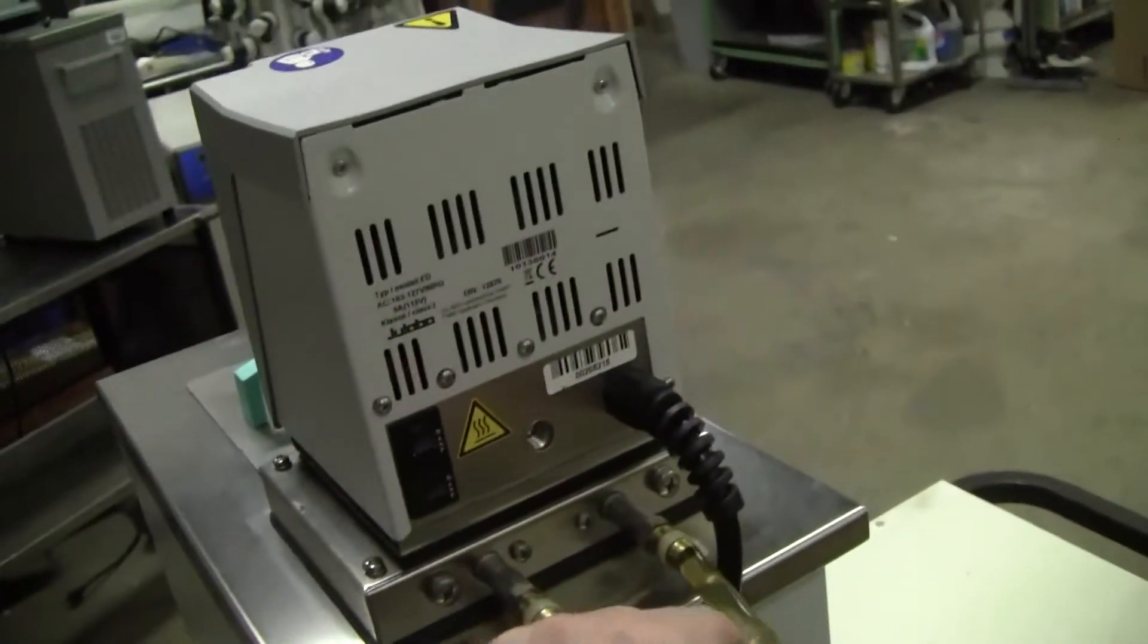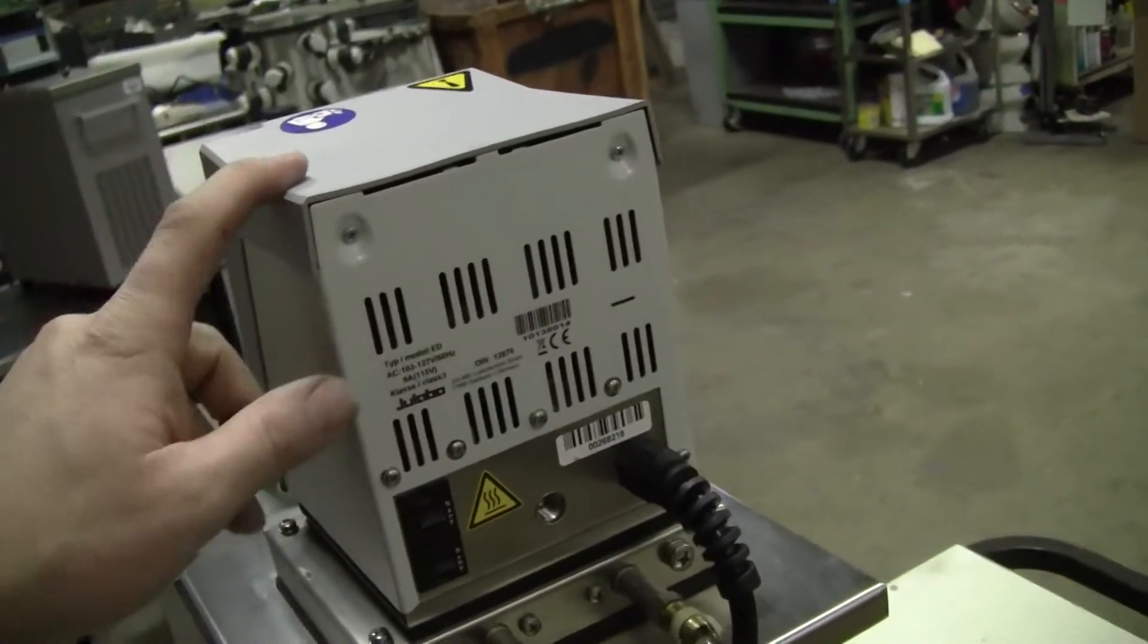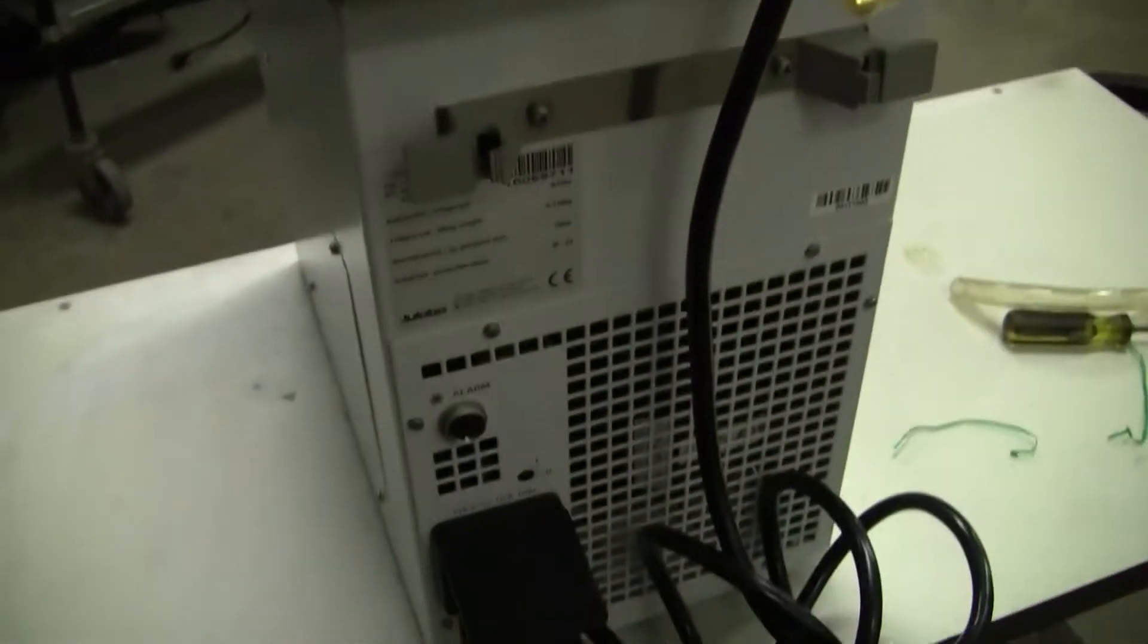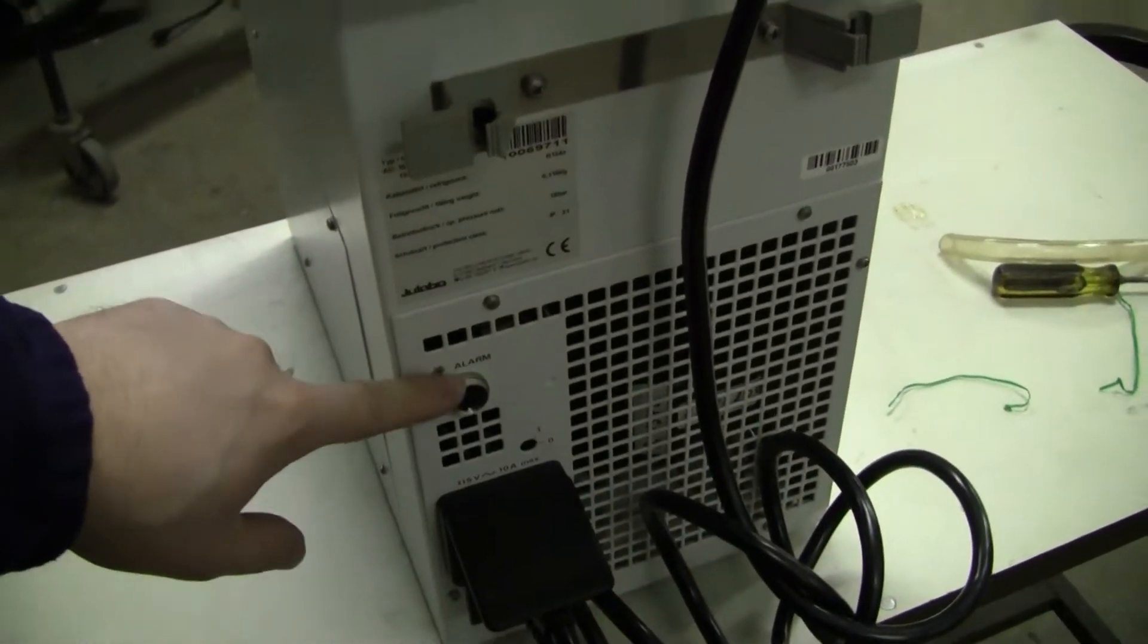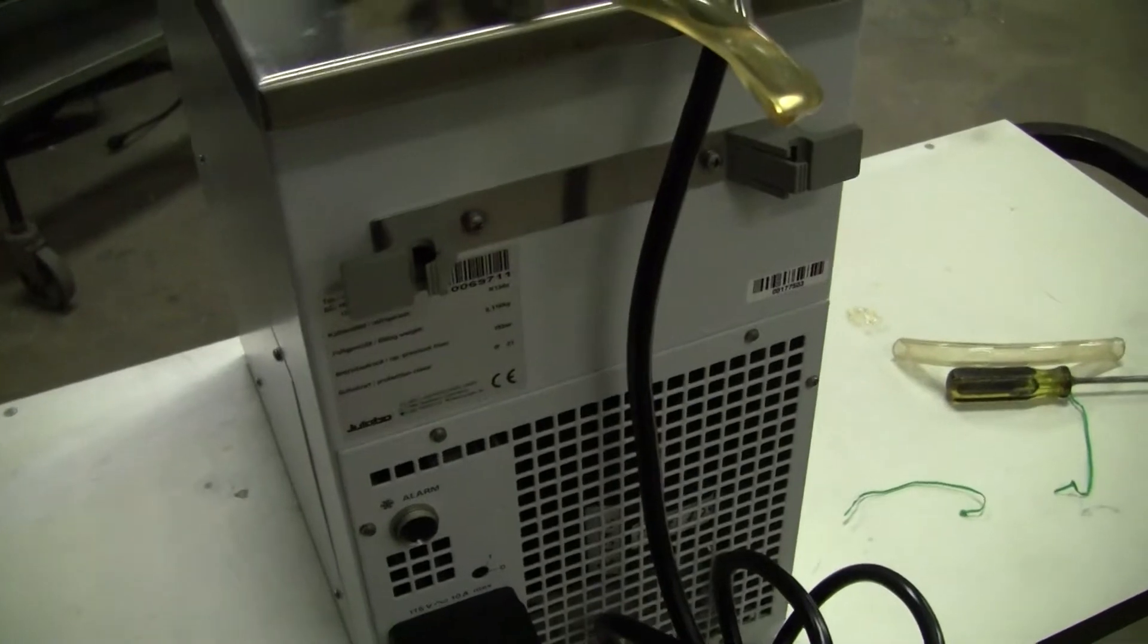In the back, you'll note that there is no temperature input to the head, taking it from the inside. The bottom of the F25 still has the alarm sensor, but it doesn't connect into the head on this one.